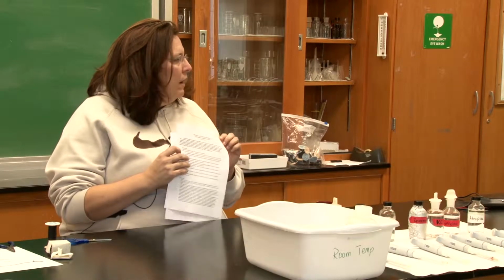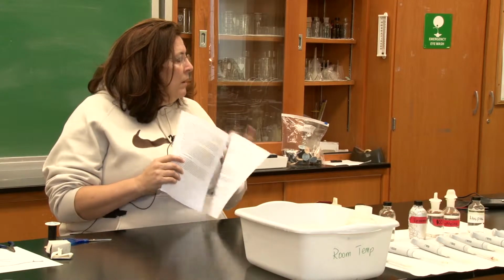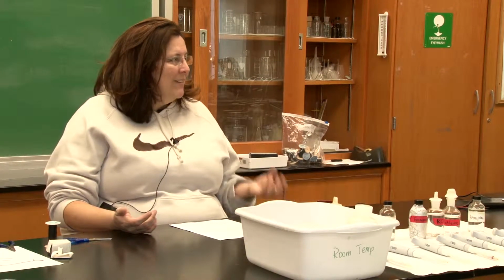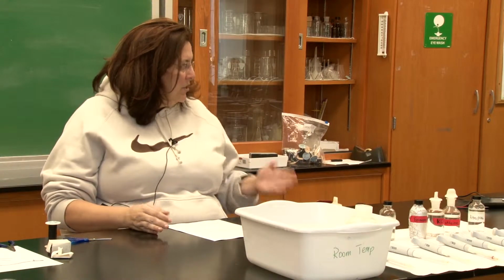All right, the epinephrine and the acetylcholine, the dry powder, are kept in the freezer in the prep closet. Okay, so you'll need to get those out and measure them appropriately. Keep in mind that these drugs can be absorbed through your skin, and especially the dried form of it is very concentrated. Make sure that you wear latex gloves when you're mixing the solutions. The other thing you need to do is check and make sure that the lab before you hasn't thrown away any of the strings with the hooks for the heart. You'll need one at each table.